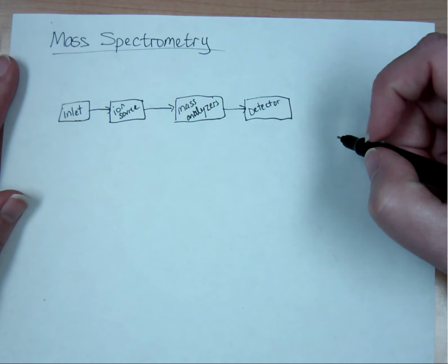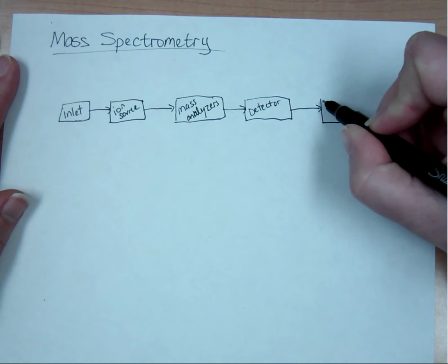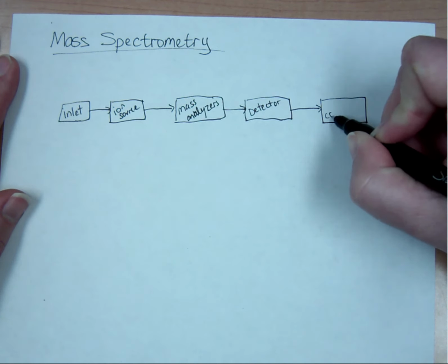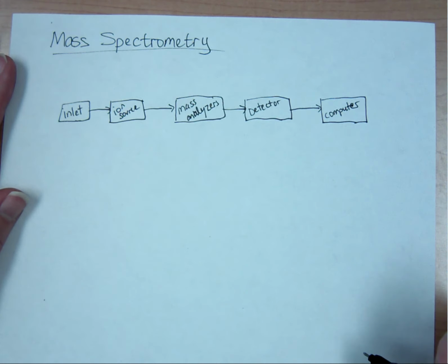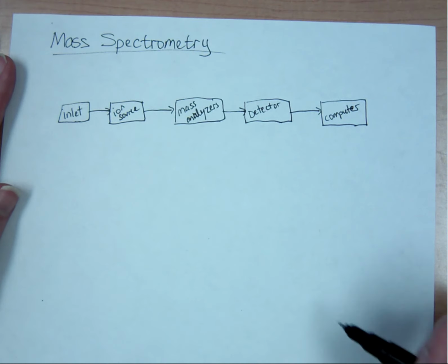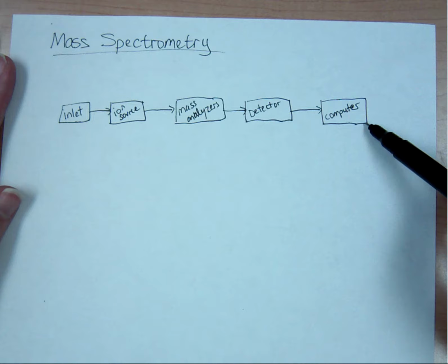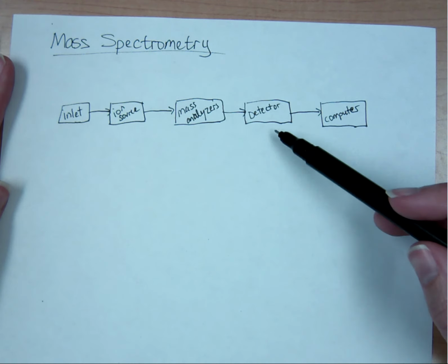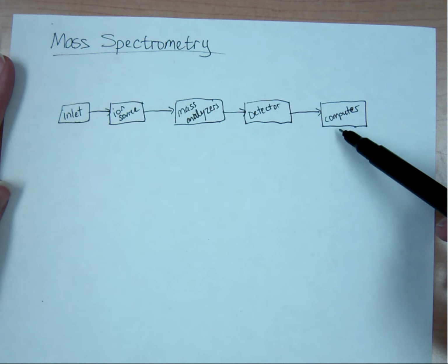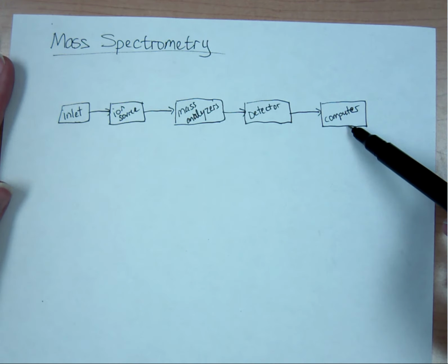Finally, we have a signal coming from the detector, which we're going to read out using a computer. And like we've talked about earlier in this class, where detectors might have some kind of a current that's then converted into an intensity, we've got that same kind of conversion of domains going on here from what our detector reads to giving a computer readout.